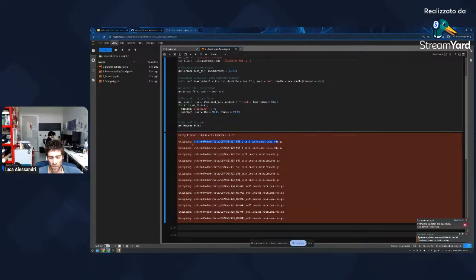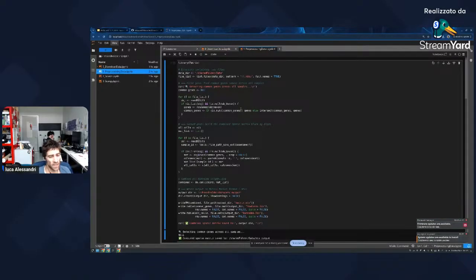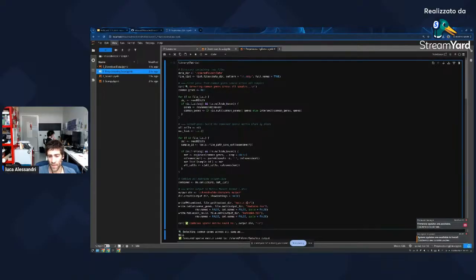MTX format is very general. It works with everything. It works with Python, with R, and other programming languages. It works pretty well also if you want to run some code with AI, for example. So just stick with it. Indeed, the very first code, the preprocessing data, is not about saying the same thing that my colleagues told you last time, but is about converting these RDS into MTX and TSV files.